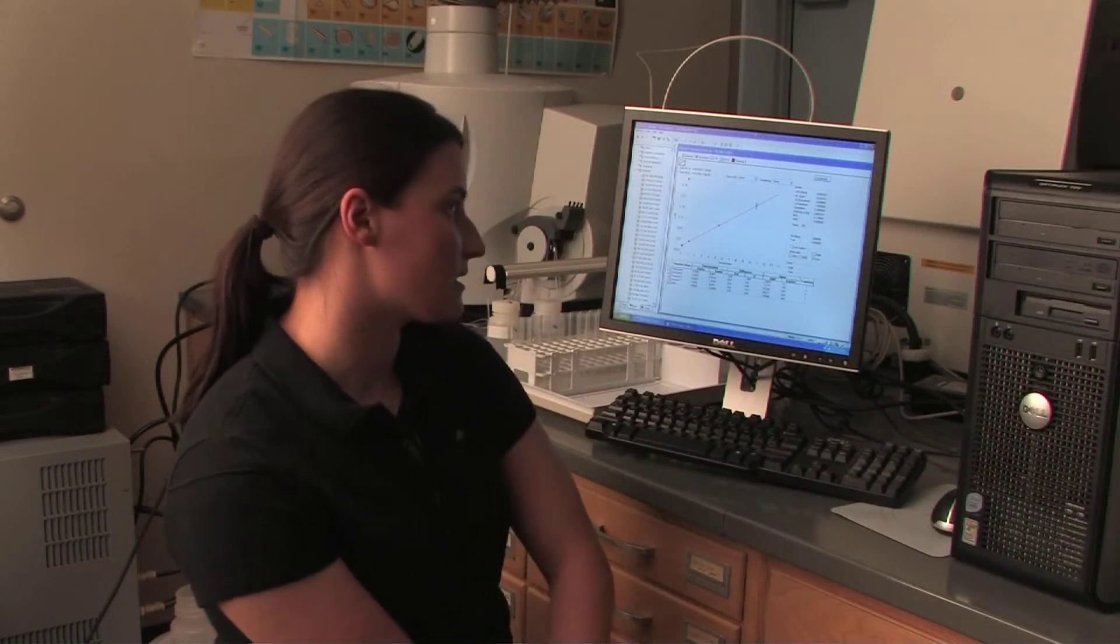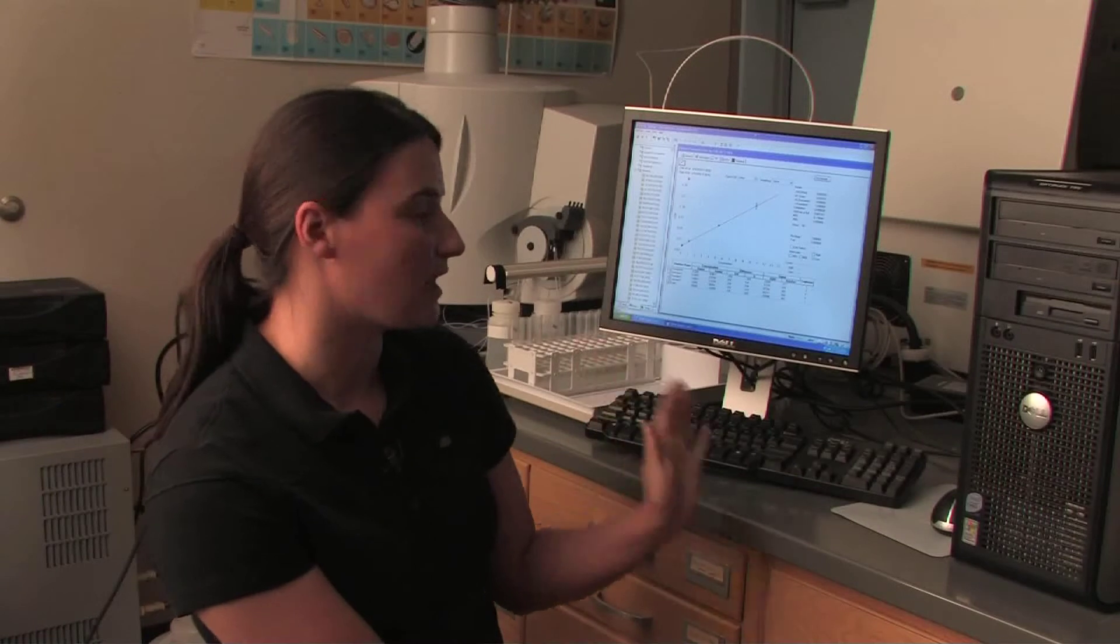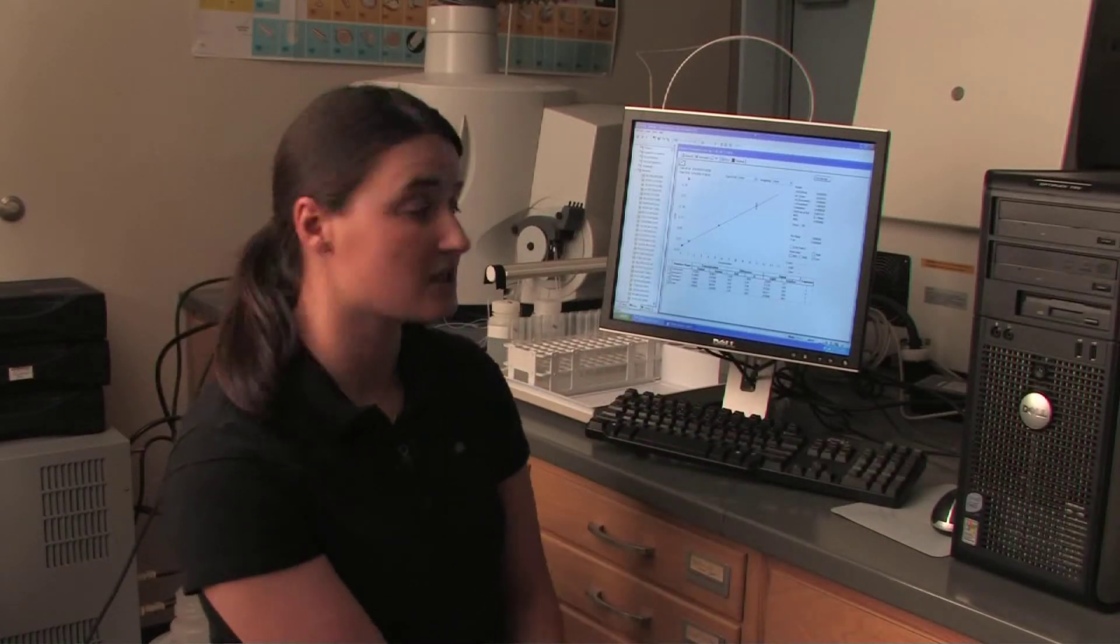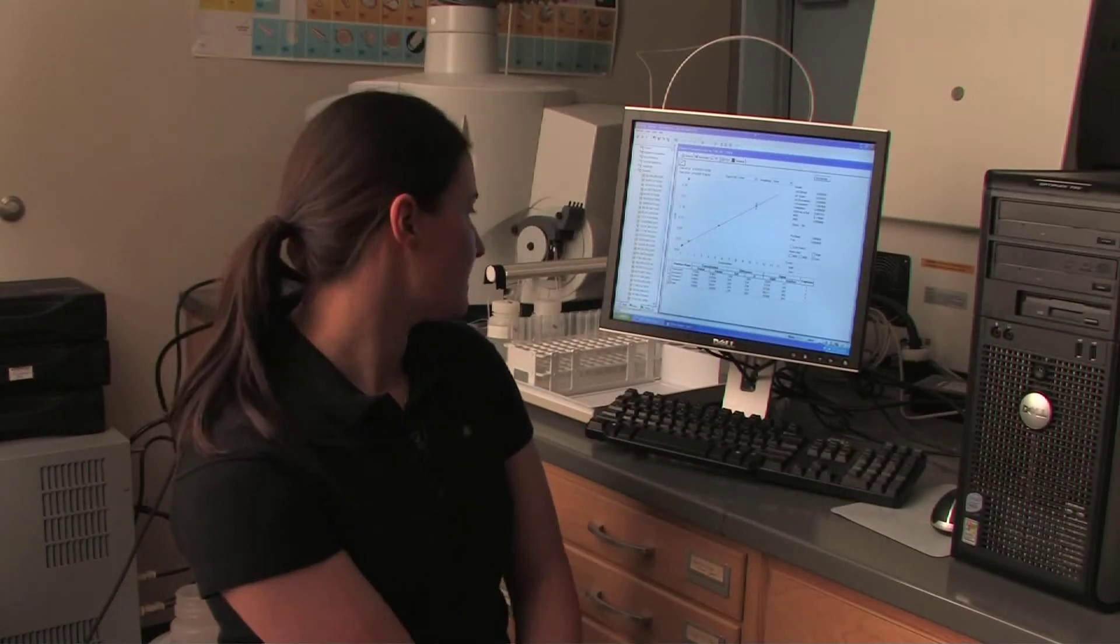As you can see behind me, this is just one of the calibration curves specifically for silver, and we can detect over 35 elements this way.